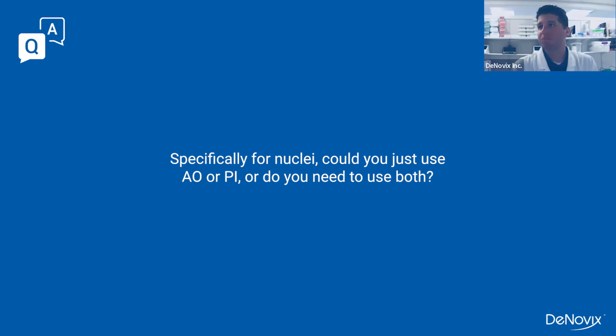Correct. That's another worthy consideration. They're not antibody pricing. They're pretty easy to buy in bulk for relatively cheap. So I would say the more powerful analysis is the combination of AO plus PI, and the combination isn't terribly more expensive than one single dye.